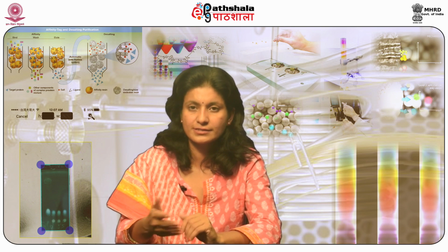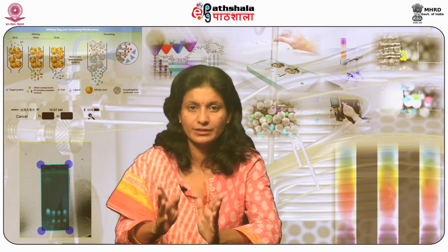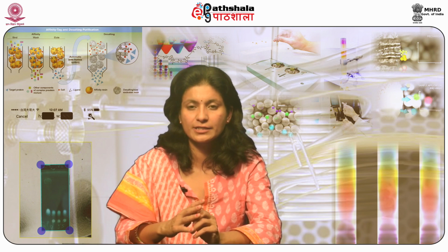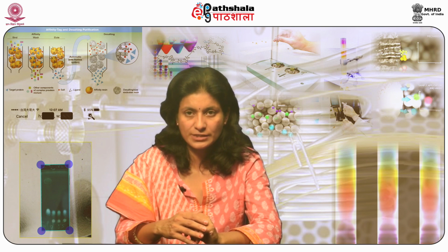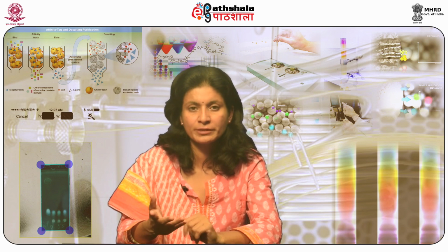It is a non-denaturing process. It can be maintained by altering the salt concentration, pH, and the ion exchange media. It provides high selectivity and can resolve molecules with little variations in charge. It can serve as a concentrating step. A huge volume of diluted sample can be applied to a media and the adsorbed proteins afterwards eluted in a small volume. It is an eco-friendly technique as it deals with substances existing in water, with longer life of resin and economical maintenance.